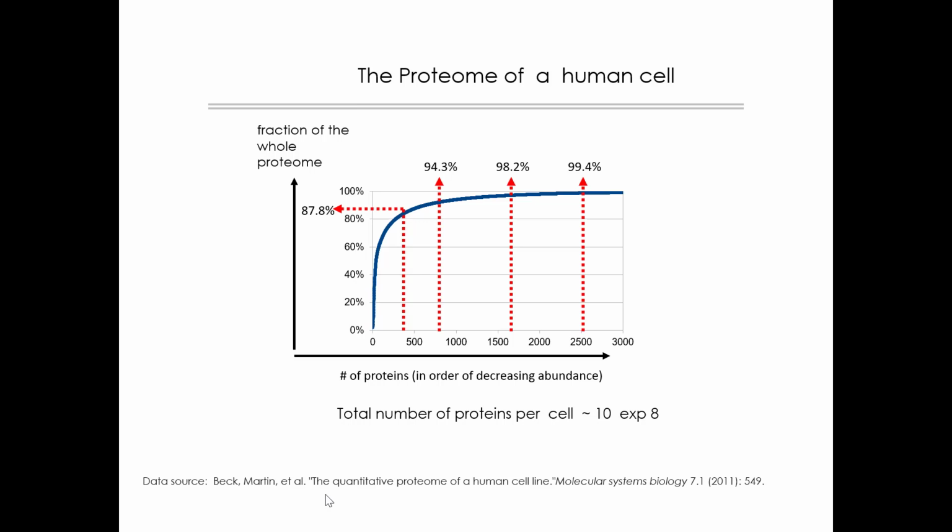So now, what does it mean when we say we can detect by DIA or any other mass spectrometric method, let's say 1,000 or 5,000 or 3,000 proteins? What I should say first is that when we identify proteins by mass spectrometry, there's always a bias towards the more highly expressed proteins. They're simply easier to catch by any method. So we generated this plot here.